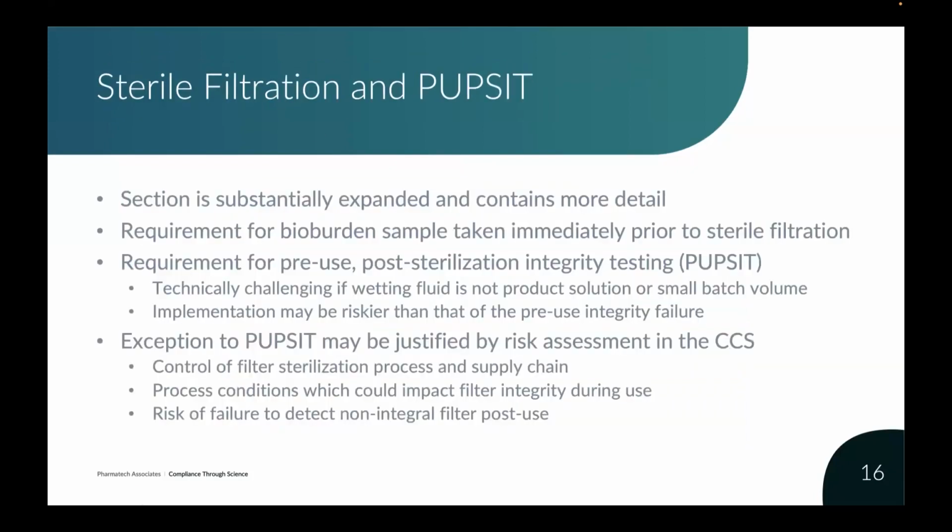Okay, now that we covered clean room and clean air systems, let's talk briefly about the sterile filtration section. This section has been substantially expanded. It contains a lot more detail than it did previously. So if you're doing sterile filtration, it's important to read this thoroughly. There is now a requirement for bioburden samples to be taken immediately prior to sterile filtration. So the expectation is that even though you've probably qualified your sterile filters to filter out a lot of bioburden, you still need to take that sample and monitor that sample.